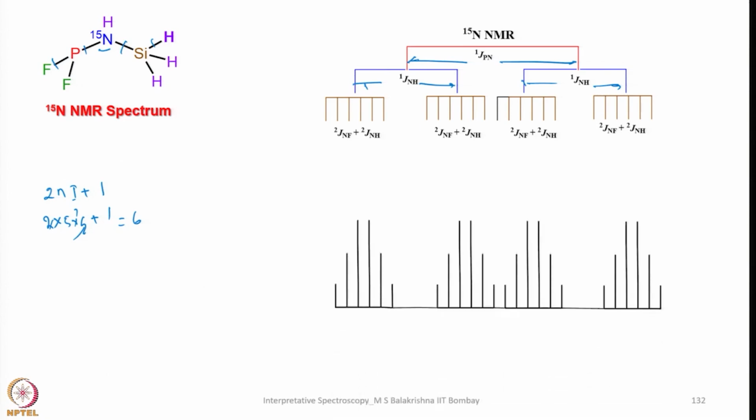Okay, so very easy. That means basically the 3 spectra that are given are for 19F, 31P and 15N. So, what is left is 1H. I had left 1H for you. So, try to sketch the NMR spectrum by writing the coupling constant tree, the splitting tree, and then see how it looks. And you can take hints about the couplings from these 3 spectral data.